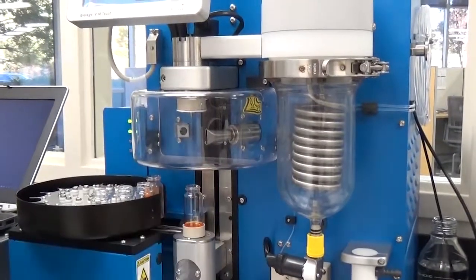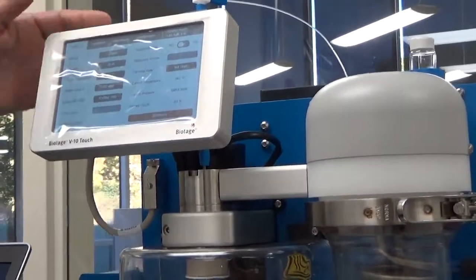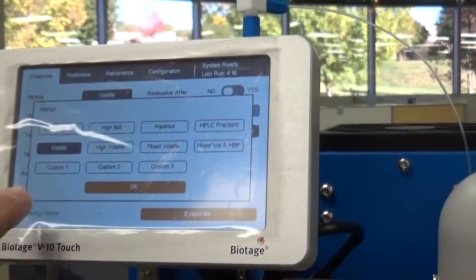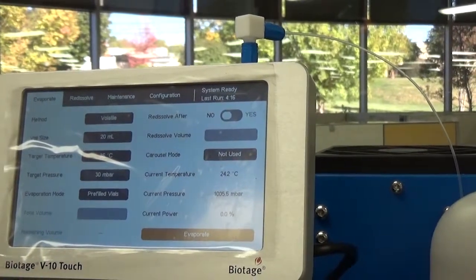So what we do, you just simply set the vial there. Make sure you get to the main screen of the V10 touch. You press volatile, or the method, and just make sure volatile is selected. It was already selected on this one.